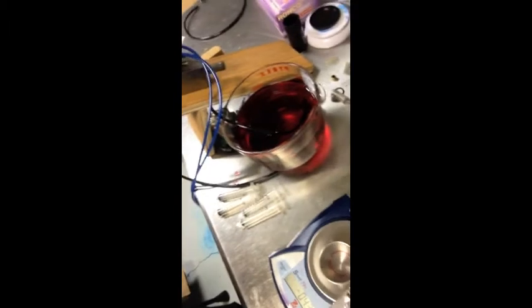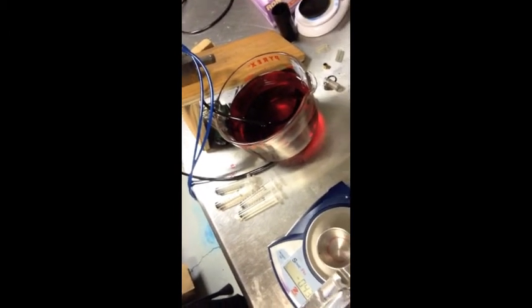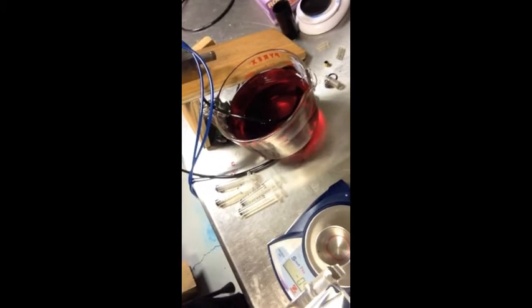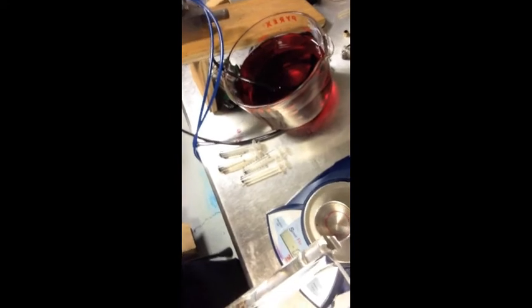We're testing out this high bar. It's going to be used for filling syringes. We're using water so that we can test for perfect specific gravity when we're filling the syringes.